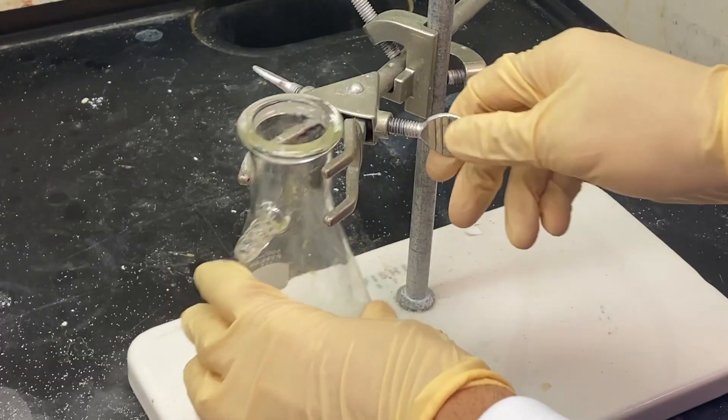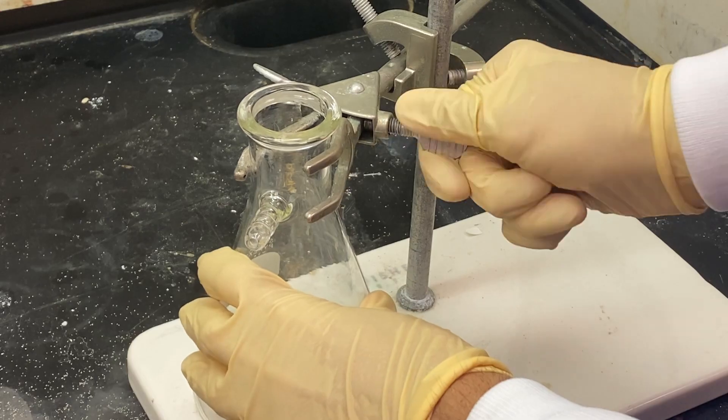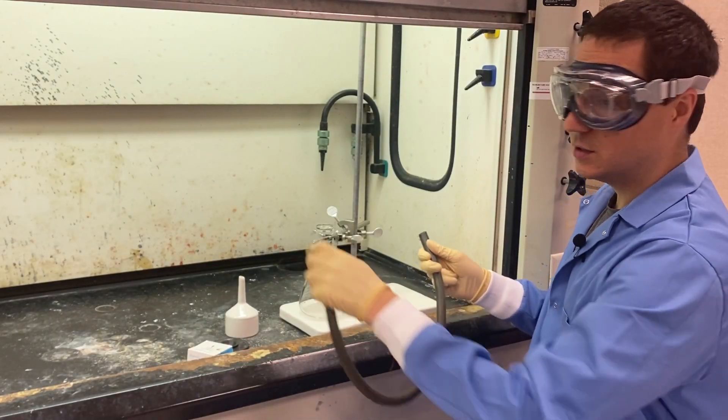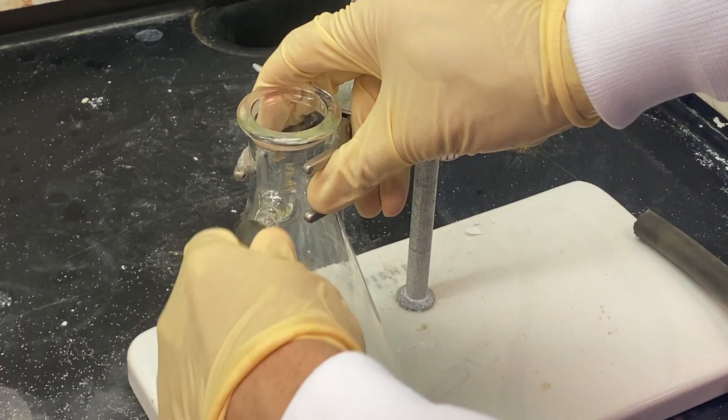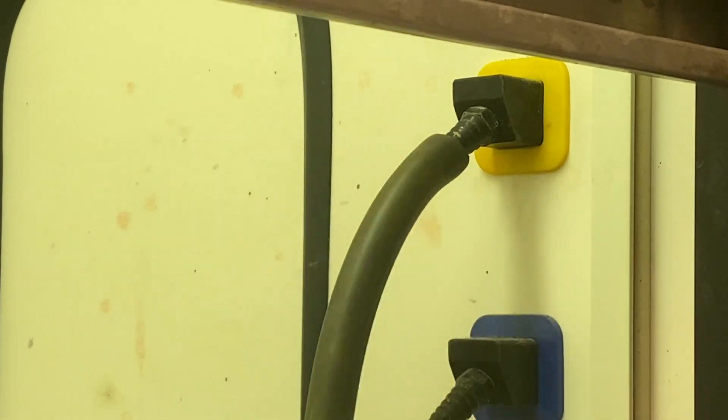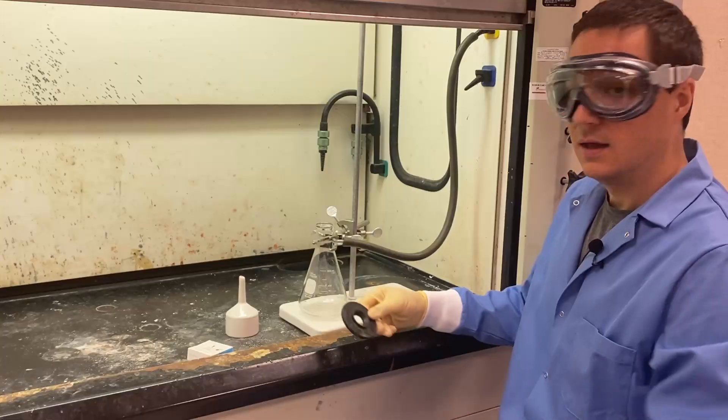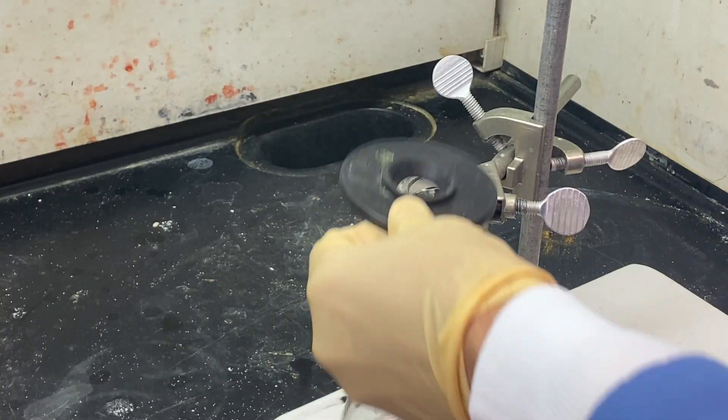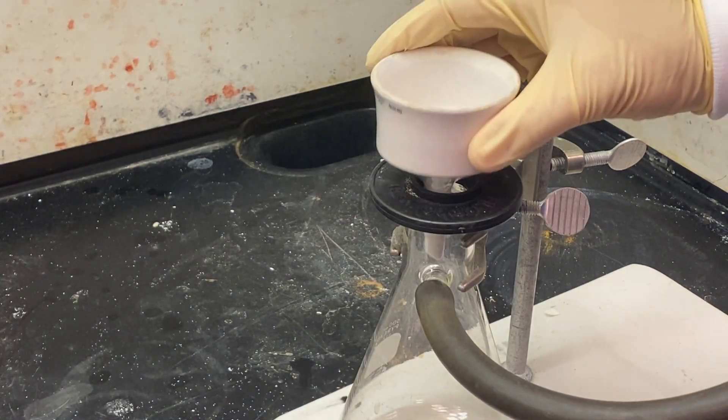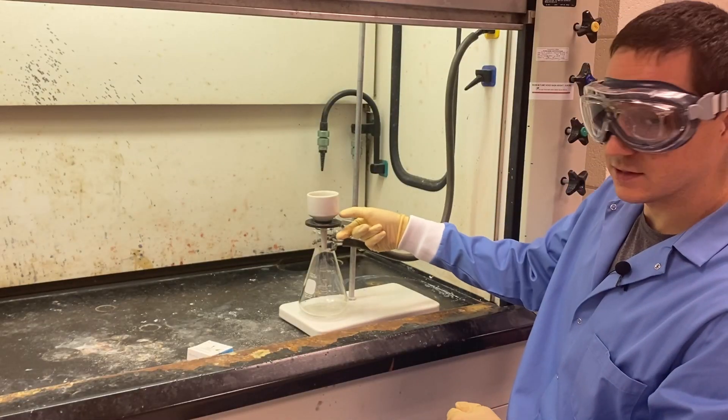First, the filtration flask is clamped down to a ring stand. Then, a vacuum hose is hooked up to the filtration flask and to the vacuum line. You'll want to place the tube out of the way. Next, a rubber ring is placed on top, and a Buechner funnel is placed in the ring. This creates an airtight seal.